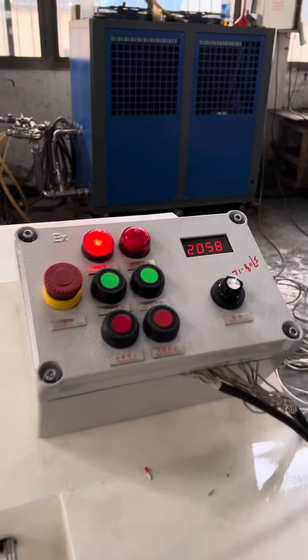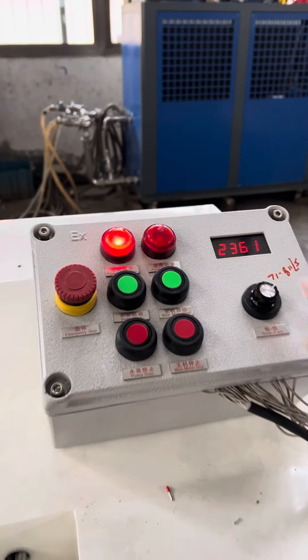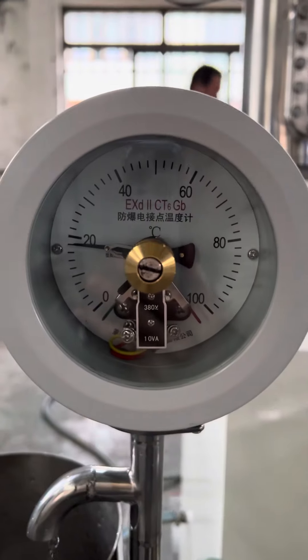We can adjust the speed to 3000 RPM. Pressure meters. Temperature meters.